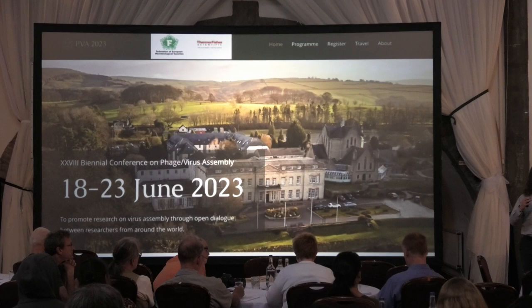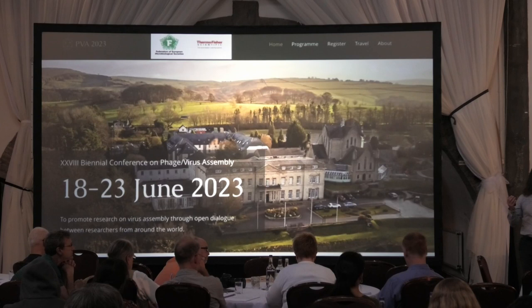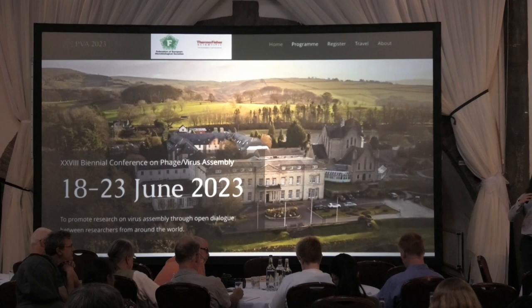So there's lots of noise in the density map, even if you try really hard to get the symmetry. We have a good C1 map where you see the portal pretty well and we see the capsid pretty well. But when they come together, it's fairly blurry. And there's a lot of sites. So we wouldn't rule out being able to see scaffolds. But I think the scaffold by this point has gone from the portal.